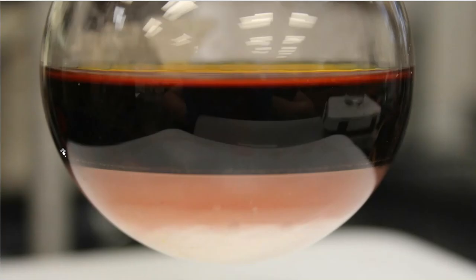Isn't that pretty? Okay, there's my boiling flask. That's after the potassium carbonate has been added. And not all of it has dissolved. You can actually see that's what that whitish clump is here at the very bottom. There's still more dissolving that needs to be done, if it will all completely dissolve. So this small portion of potassium carbonate down here at the bottom, that is this whitish clump. And then you still get two layers. We have had two layers the entire time, folks. They've just changed color on us. That's all that they've done. So this is all that I did that day.